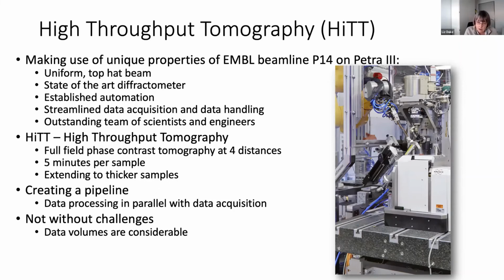And as Rosy alluded to in her introductory first half of this session, we have huge advantages at the synchrotron in that we can do everything much quicker because we have very, very intense X-ray beams. And so by including the automation, we can actually have an even greater throughput for large volumes of samples by using the robotic sample changer.